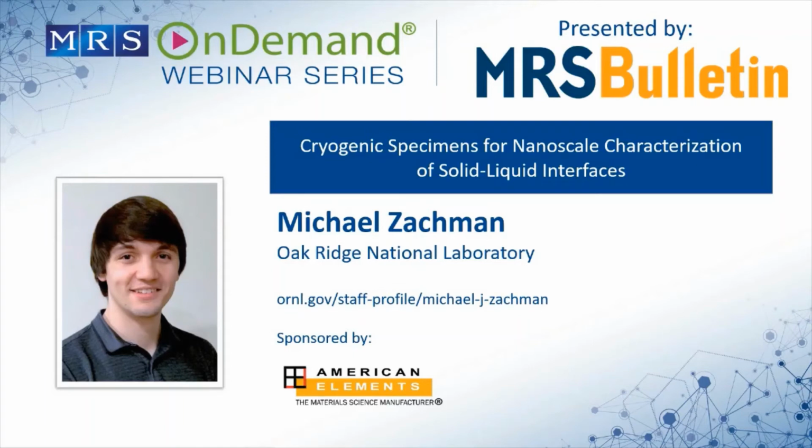Right. So what would you say currently is the biggest limiting factor for analyzing samples by cryo-FIB lift-out and cryo-STEM? Mm-hmm. That's a good question. These are all very early techniques. Only a few people are doing it so far, and so there are a lot of things left, but I think one of the biggest limiting factors, once you get over the human experience of doing it, you have to get good at it, which takes quite a while. Once that's not the limiting factor anymore, the limiting factor is probably contamination, I would say.